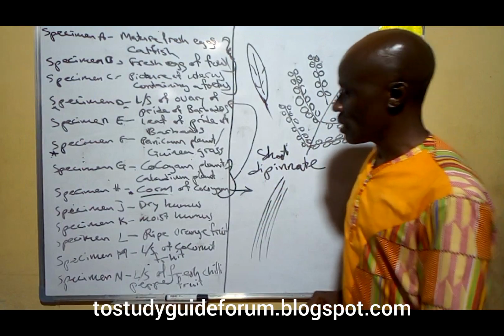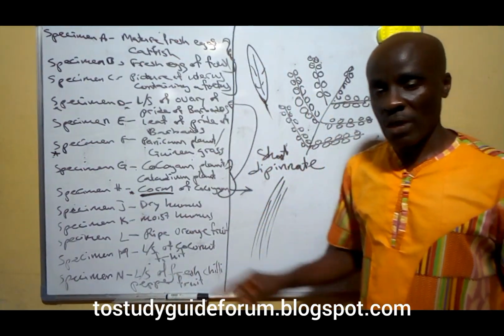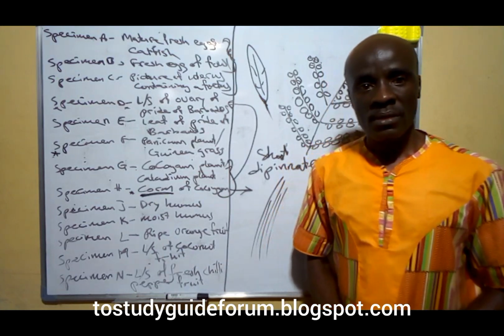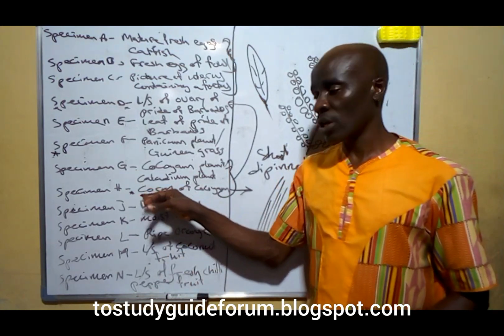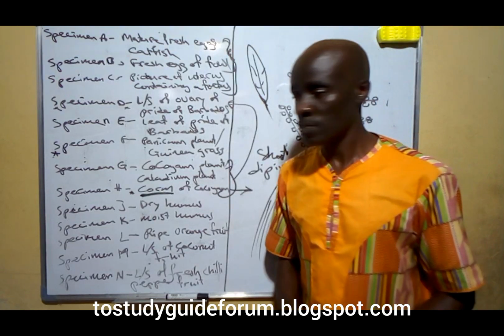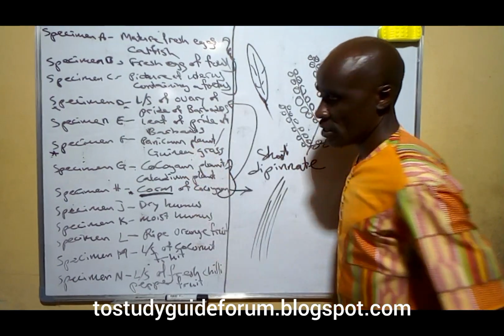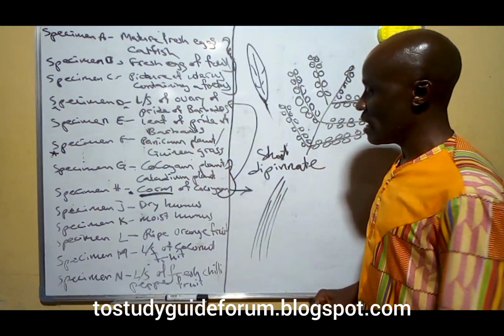As a storage organ that stores starch, when you drop iodine on it, it turns blue-black, meaning that the storage substance is there. What they store is starch. Like I've already told you, this one is for vegetative propagation.